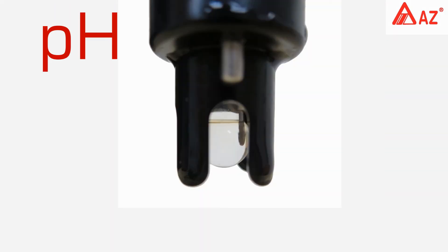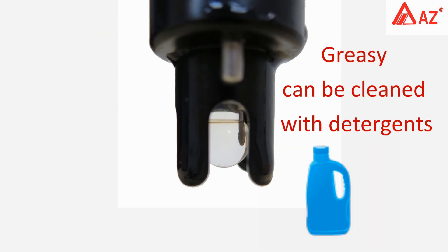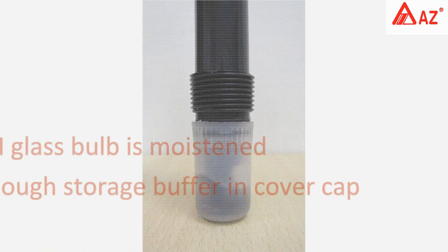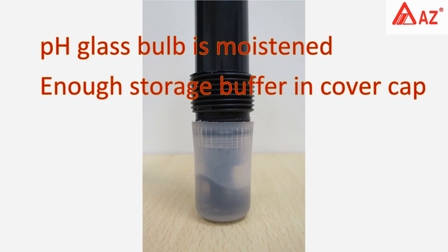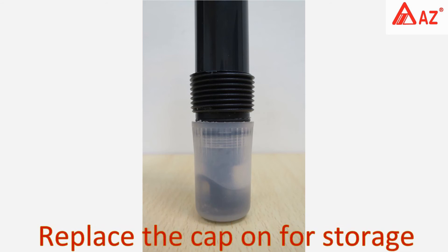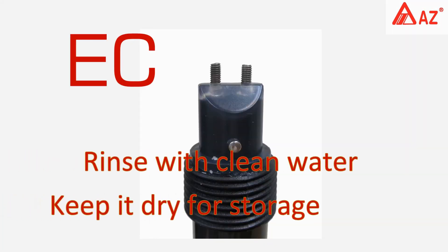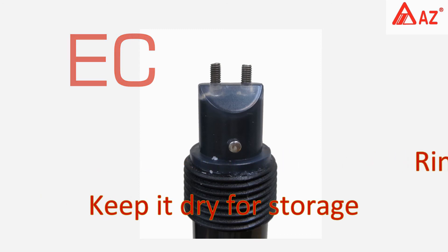Do not twist or fold the strain relief cable. If the pH probe is stained with grease or dirt, clean it with neutral detergent. Make sure the pH glass bulb is moistened at all times and there is enough storage buffer in the cover cap. Replace the electrode cap for storage. For the conductivity probe, rinse with clean water, then wipe and keep it dry for storage.